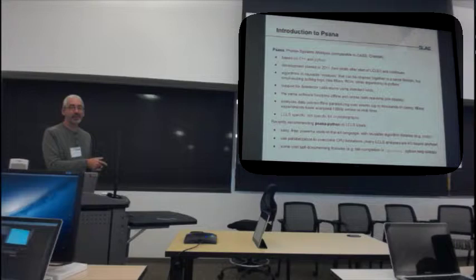We have support for detector calibrations for CSPAD. We're about to expand this quite a bit. And you're going to find I'm going to repeat myself probably too many times during my talk. The same software runs online and offline, real-time plots, parallelize over events. You can go do 120 hertz online. Many experiments have done that.